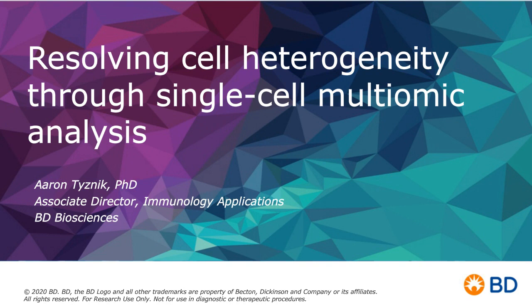Thank you. I was on mute. Yeah, so the system allows us to query as little as a few hundred cells, up to as high as 20,000 cells per cartridge. If one was to take advantage of the multiplexing kit, we could permit people to go as high as 40,000 cells per assay.